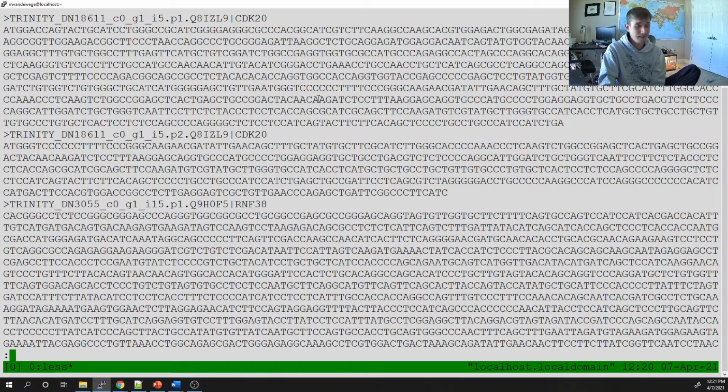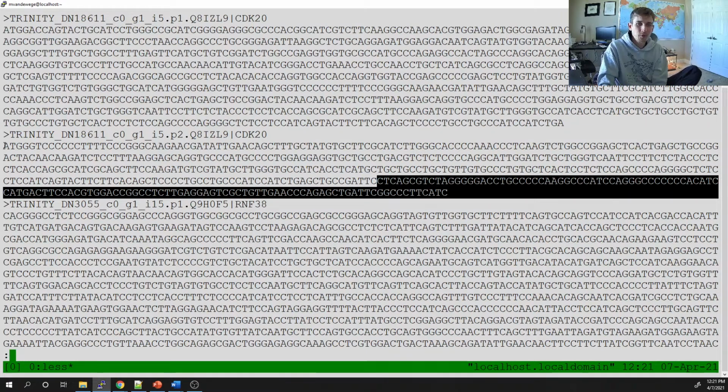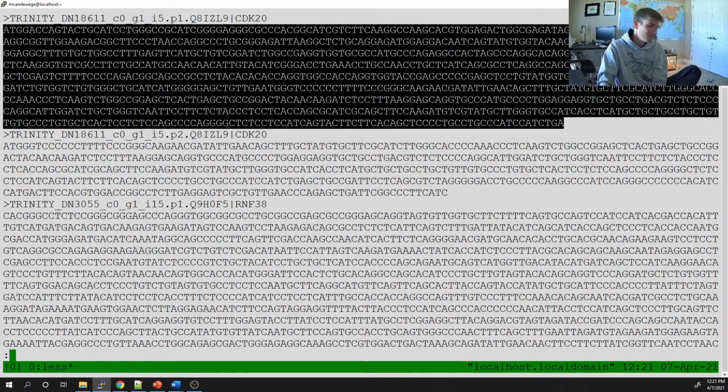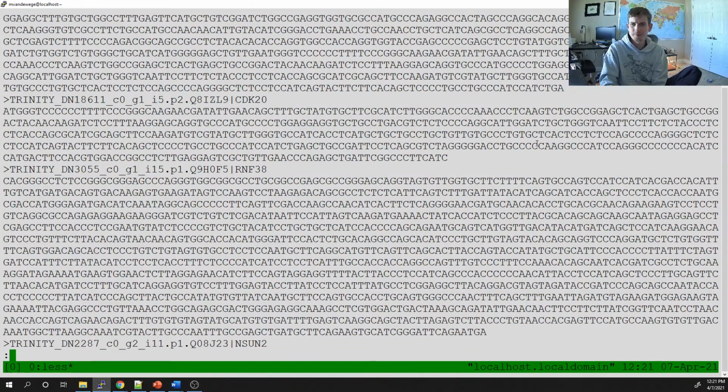I'm going to leave it alone, because what we might be seeing is this might be a partial gene. This might be partial on the 3' end. Or right, so just because there's an ATG doesn't necessarily mean that's the right start codon. And so it's very possible this is like the 5' region of that gene, and this is the 3' region of that gene. Or an alternatively spliced transcript, something along those lines. So I'm hanging on to everything. If it was annotated, I'm hanging on to it, and I'm not going to touch it.